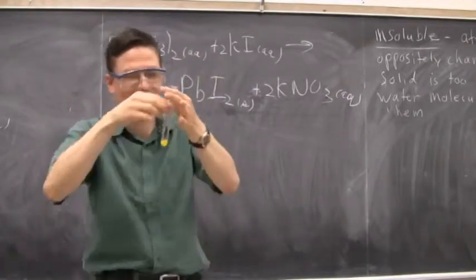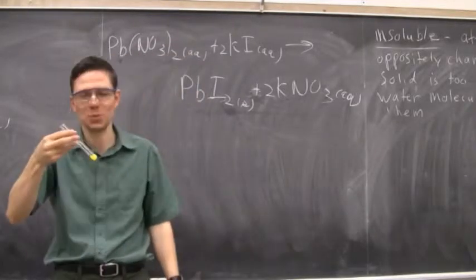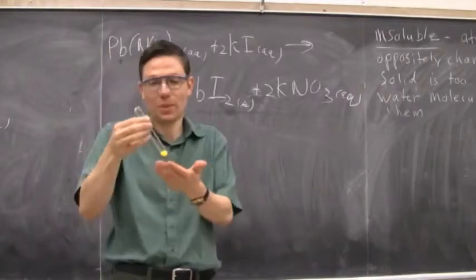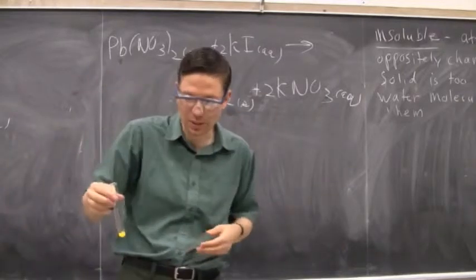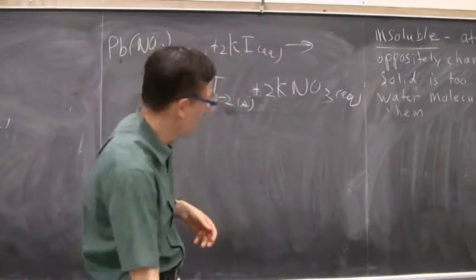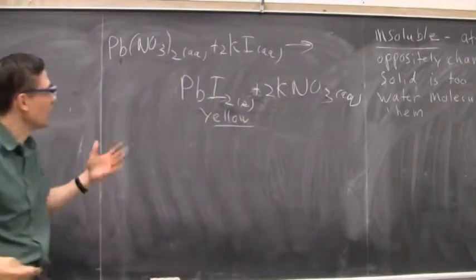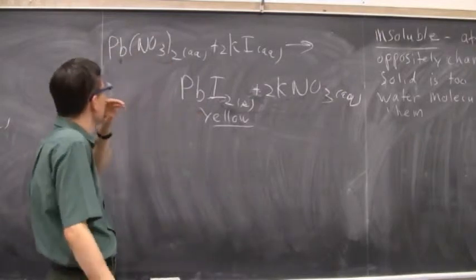Yay! All right, so a lot of times people laugh at it, but a lot of people became chemists because of the pretty colors. For myself, it was something like that: 2 colorless solutions, how would I get yellow? And we want to know why. All right, so we get a yellow color there. Let's put yellow with this one. You're not going to have to ever know what the colors are. I don't expect you to know that. All right, so that's one example.